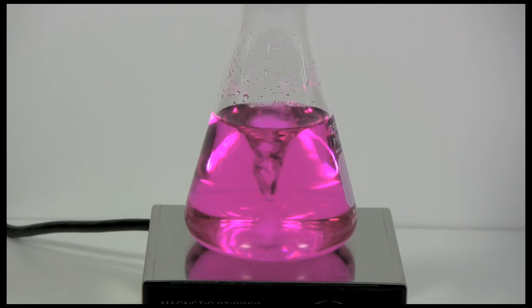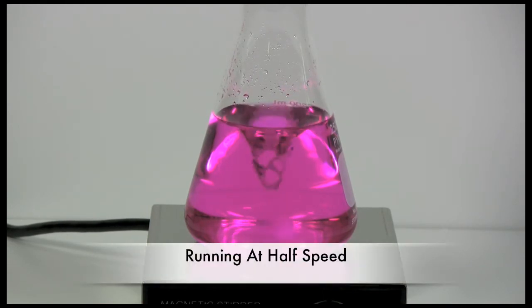One of the nice features of this magnetic stirrer is how quiet it operates. You'll notice it barely making a sound as it stirs here.